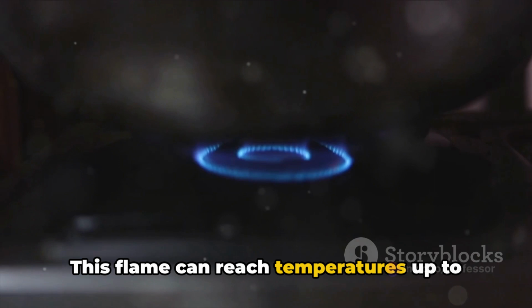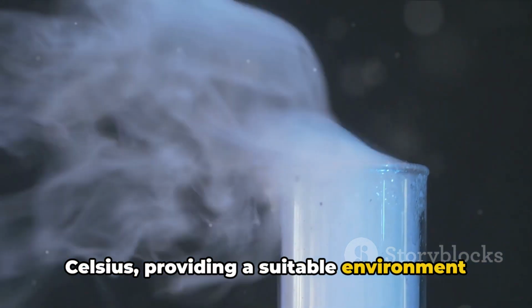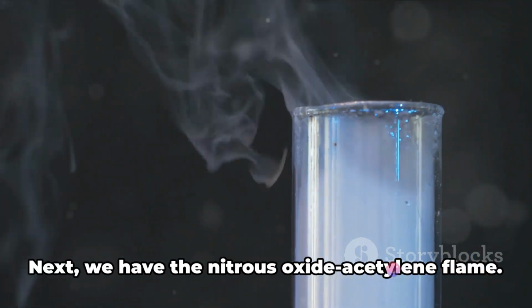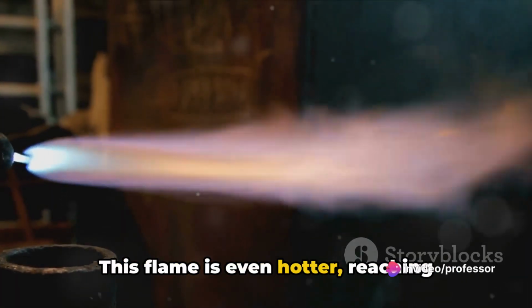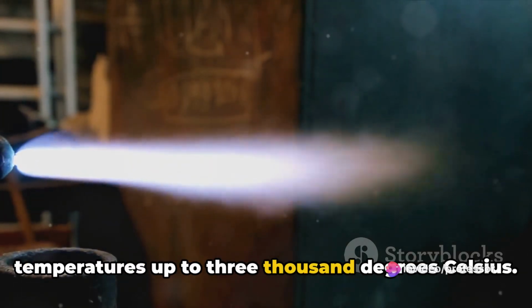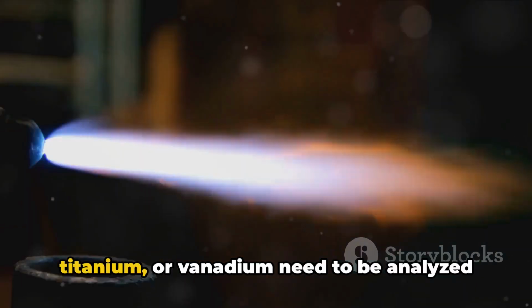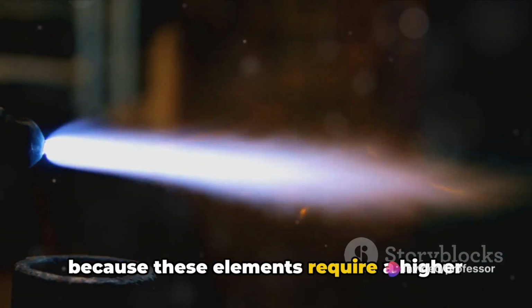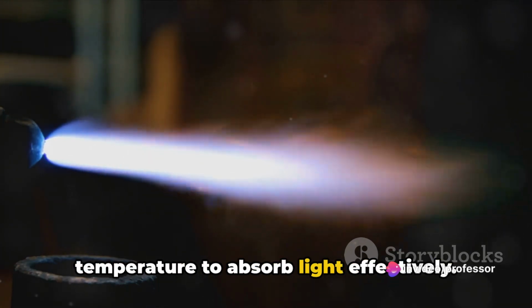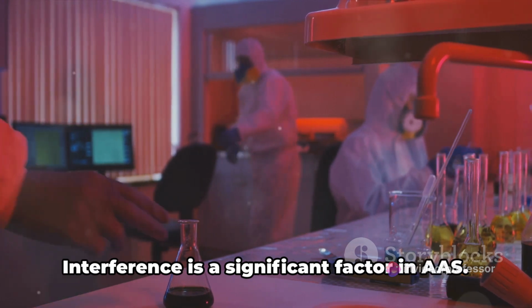This flame can reach temperatures up to 2,300 degrees Celsius, providing a suitable environment for most atoms to absorb light. Next, we have the nitrous oxide acetylene flame. This flame is even hotter, reaching temperatures up to 3,000 degrees Celsius. It's used when elements like aluminum, titanium, or vanadium need to be analyzed because these elements require a higher temperature to absorb light effectively.